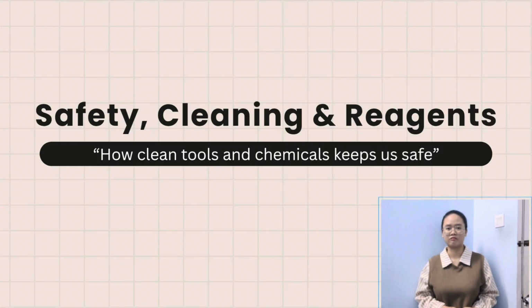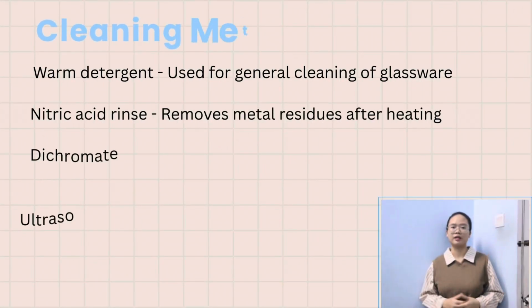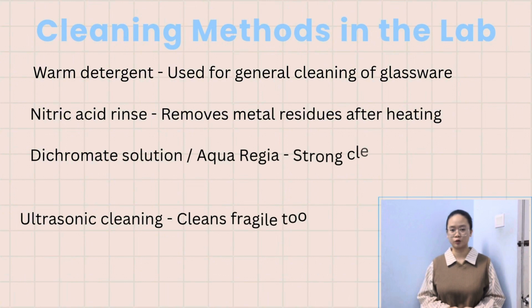Imagine performing a food safety test or checking if water is clean, but using dirty glassware or contaminated chemicals. The results would be completely wrong, and that could be dangerous, especially in fields like medicine or food testing. To prevent this, laboratories follow strict cleaning procedures.